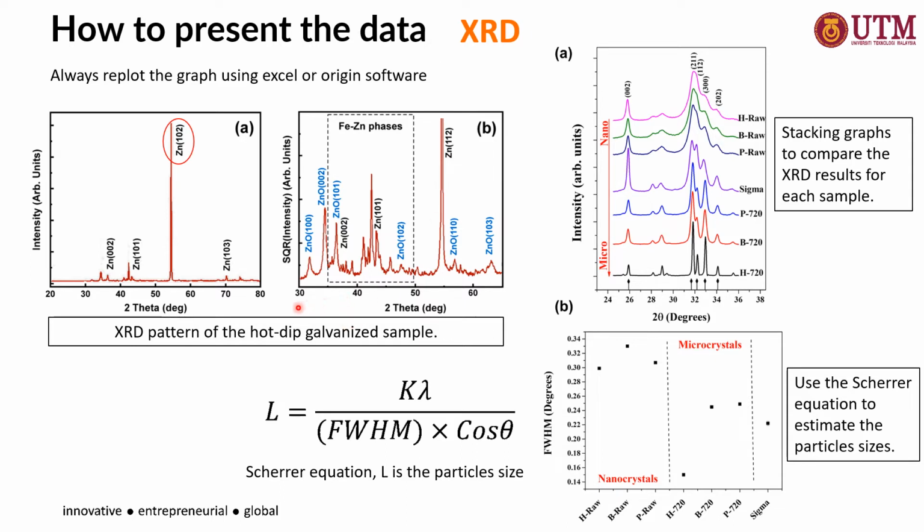Which means that when you do the analysis, it's not necessary that you need to take more readings on your sample. Actually, for one single reading, you can analyze the data properly after you replot the graph on a much more specific range.